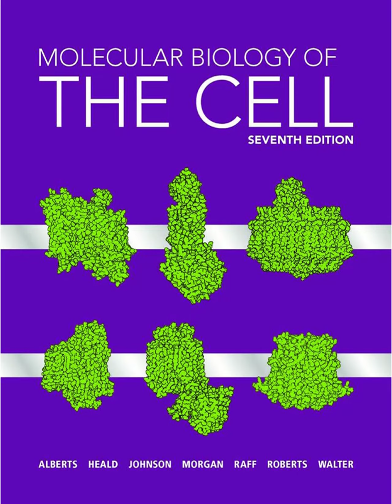Ah, so multiple secondary antibodies can bind to each primary antibody. Exactly, you get signal amplification. Many fluorescent tags binding indirectly to your target, making the signal much brighter and easier to detect. We see this used beautifully to visualize things like the microtubule cytoskeleton.